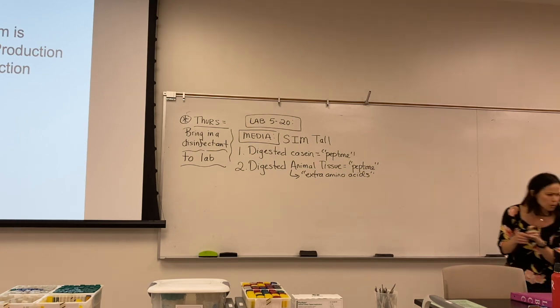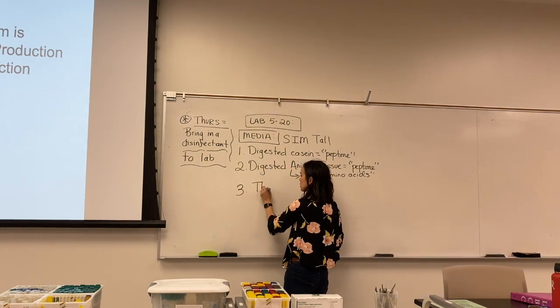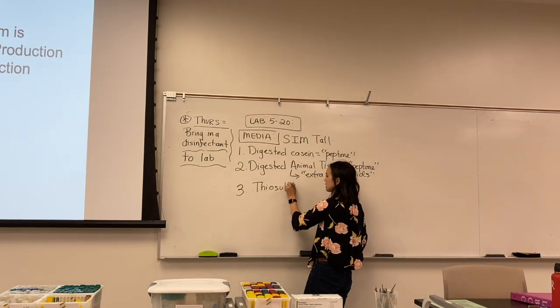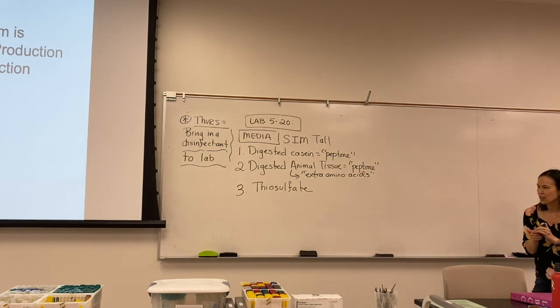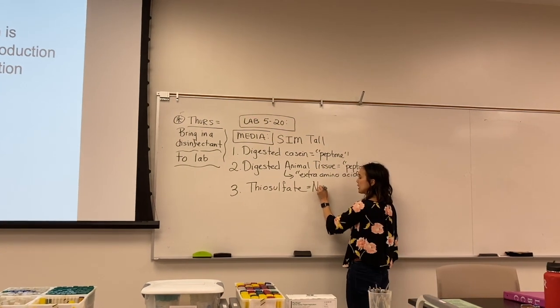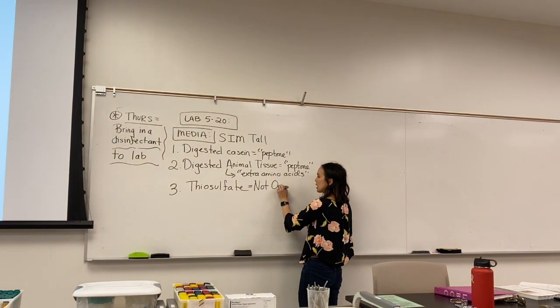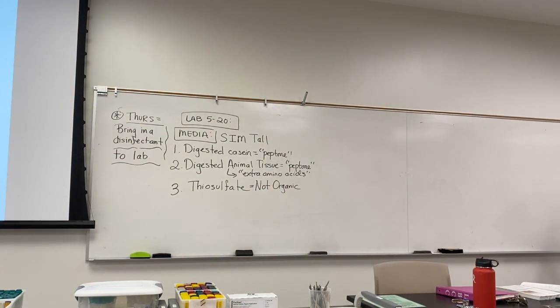Other than that though, we have an ingredient you guys have seen before, thiosulfate. I wanted to clarify it again though, because thiosulfate has come up on a lot of the labs. It's not organic, so it's not in any of the categories that we've talked about.